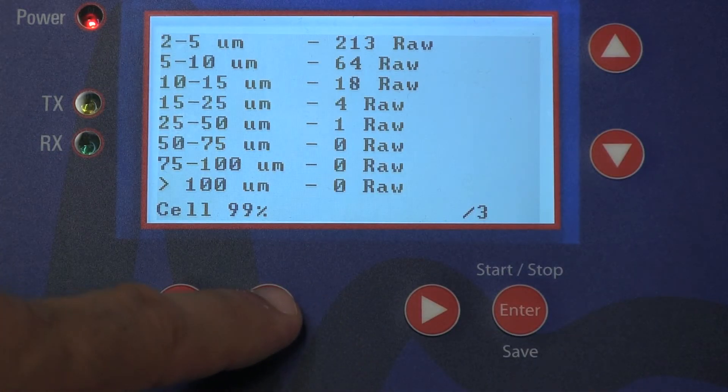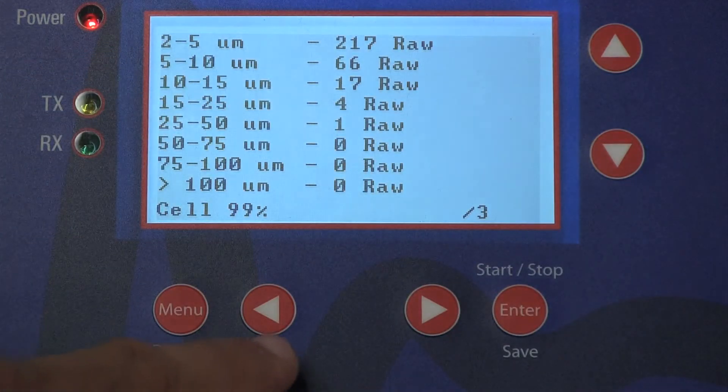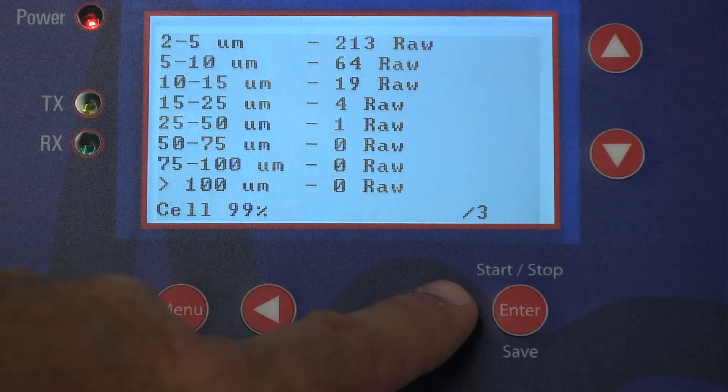Data can also be downloaded using a computer connected via a USB connection on the side of the unit. Chemtrax's GRABIT software allows for data to be downloaded in a Microsoft Excel spreadsheet format.